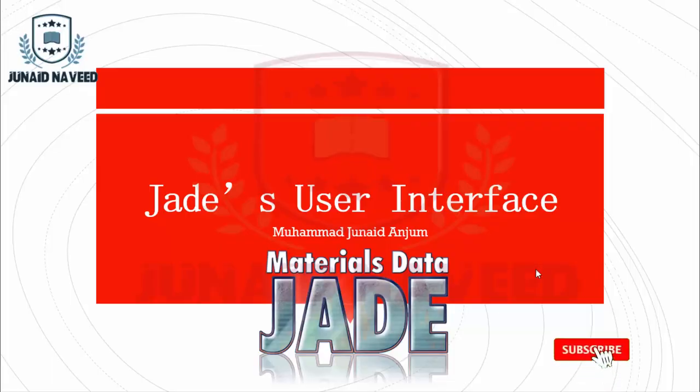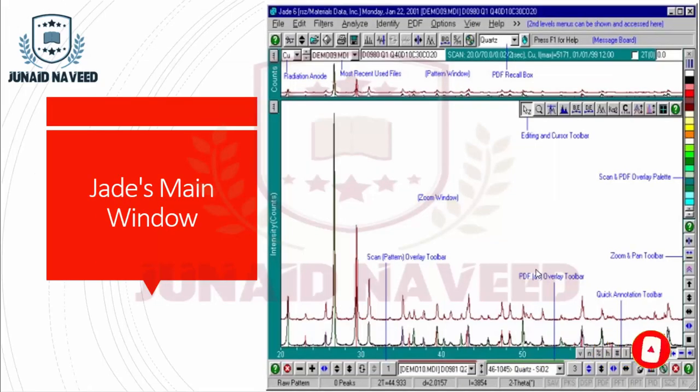Today is our first lecture on module 1, Jade user interface. We will start from the Jade main window. The Jade main window will look like this, and there are different components of the main window. As you can see, this is the radiation anode, most recently used files, pattern window, PDF recall box, editing cursor, scan and PDF overlay palette, zoom and pan toolbar, PDF overlay toolbar, quick annotation toolbar, and scan pattern overlay toolbar.